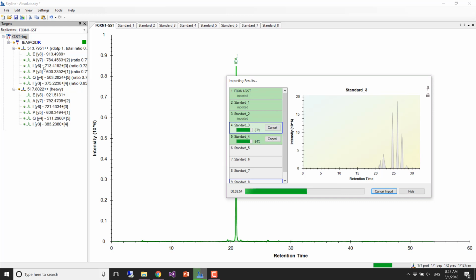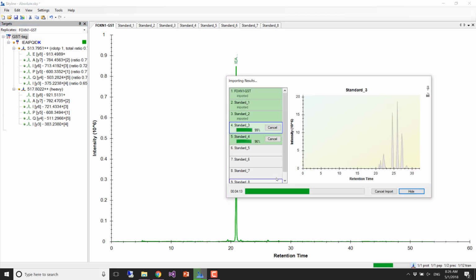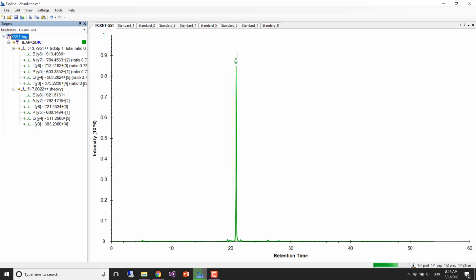Okay. So you can see, I'm going to hide this. And again, does everybody remember how to get this back if you've hidden it? There's this button down in the bottom in the status bar that will bring the UI back at any time you want. And it seems to be going a little faster now. Maybe we'll get through this, but I'm going to hide it again.